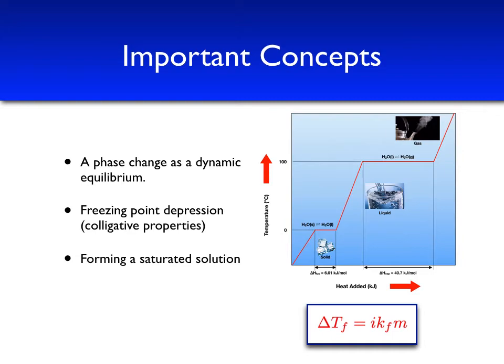The last variable is the molality of the solution. The molality is one form of concentration and is equal to moles of solute dissolved per kilogram of solvent. We're also going to attempt to keep the molality as constant as possible. However, this might not be the case, as you'll see later in the experiment.